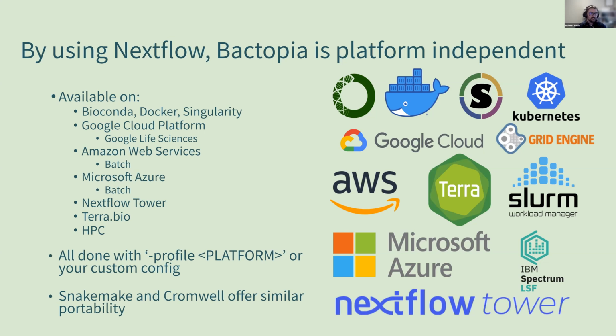One thing that's awesome is that by using a workflow manager such as Nextflow, I'm pretty much platform independent. This is not Nextflow in particular; most workflow managers now will do this for you. Are there hiccups getting set up on some platforms? Yes. But once you get that initial configuration set up, you're off to the races. You can use Conda, Docker, Singularity, any of the cloud platforms. Nextflow Tower, we didn't really talk about, but I'd recommend you check that out. It's a fun way to launch Nextflow pipelines from a web page. All you have to do is change this -profile to your platform of choice, and you can customize those to your system.